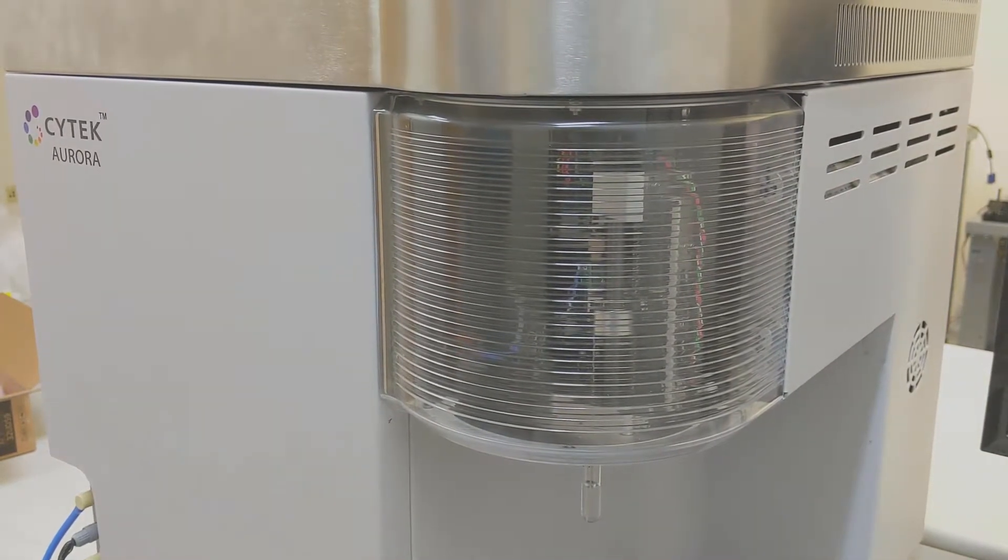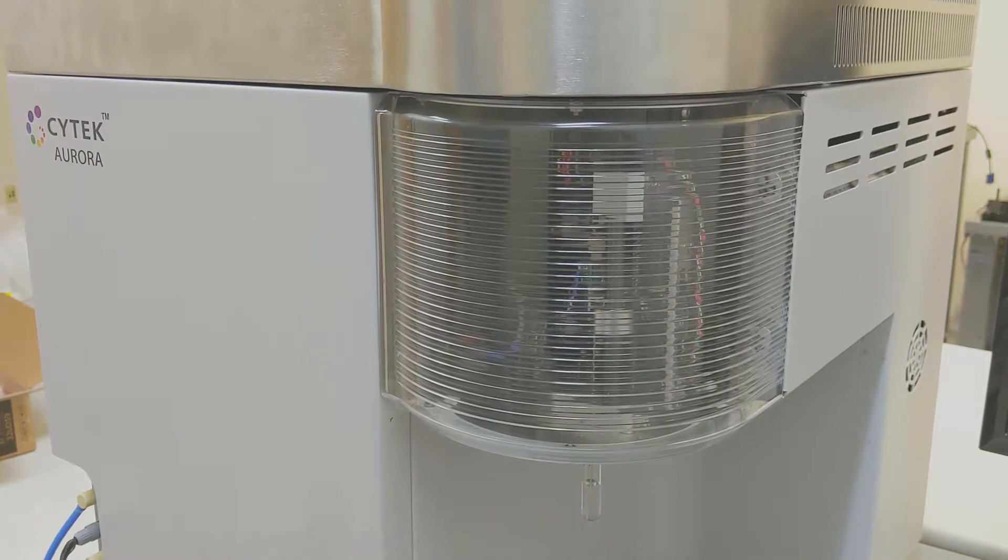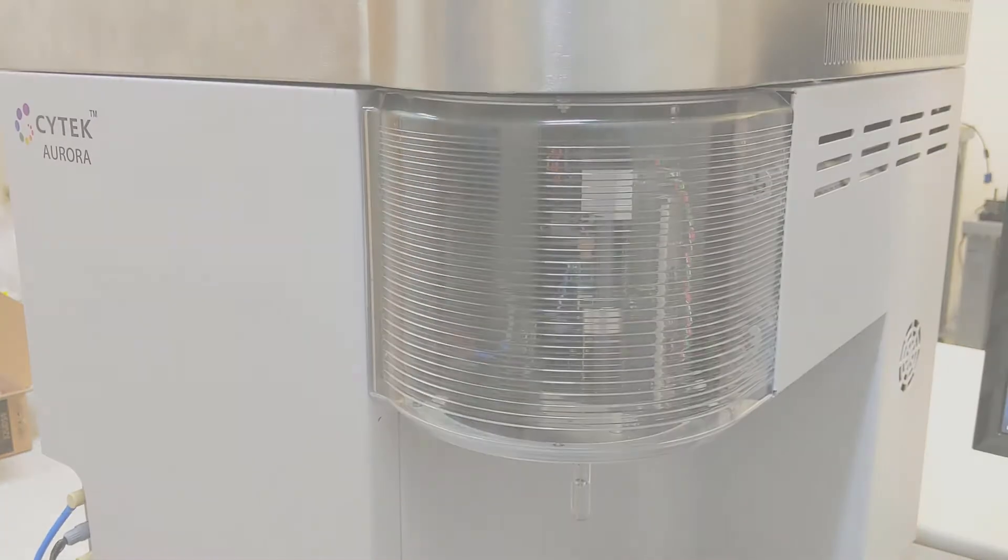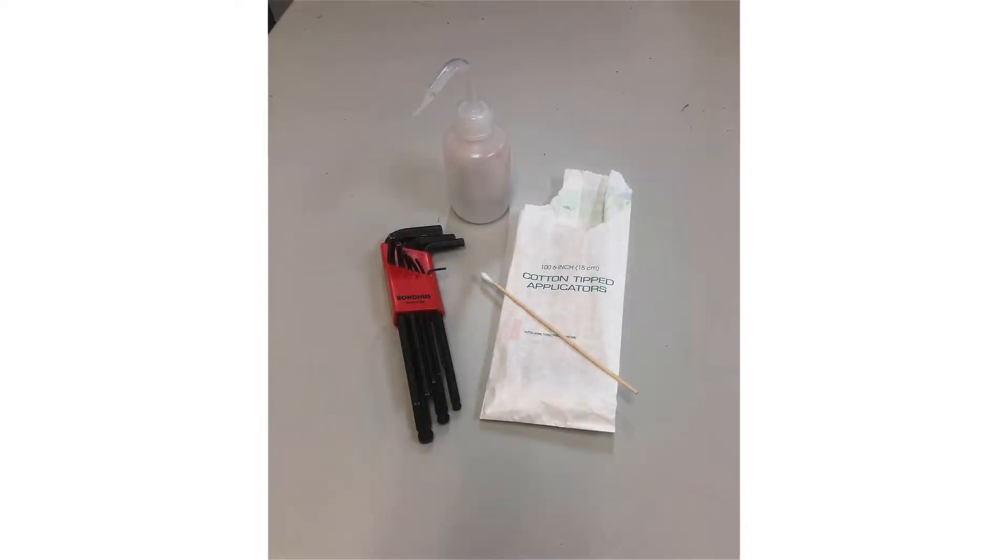Often this happens if salt builds up on the sit flag, which is what triggers the tube present or tube absent logic for the software. To get started you'll need a metric Allen wrench M1 size, some cotton-tipped applicators, and some DI water.